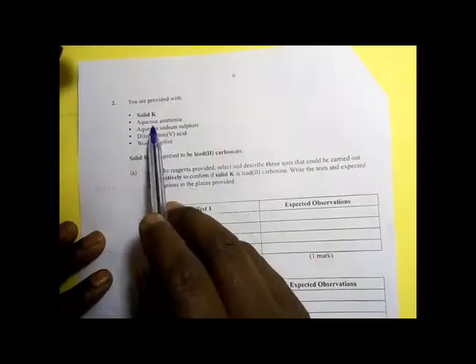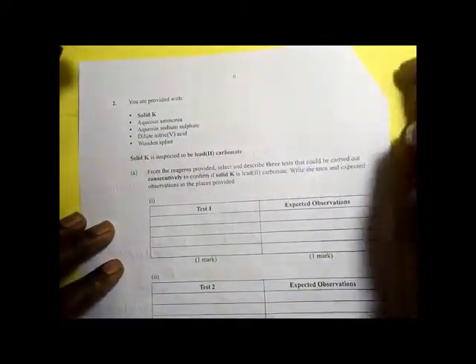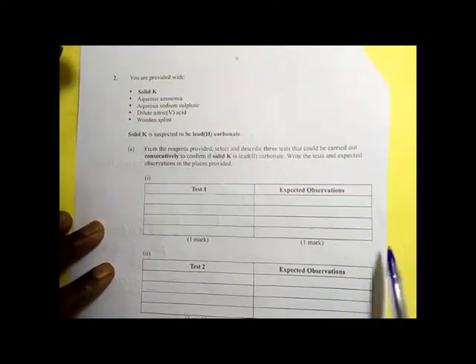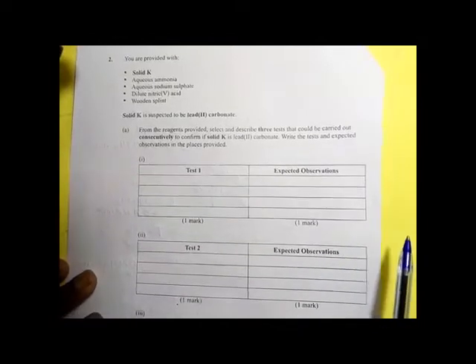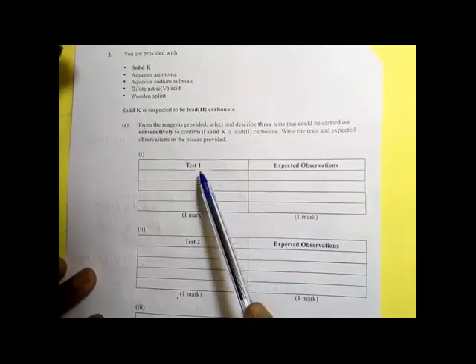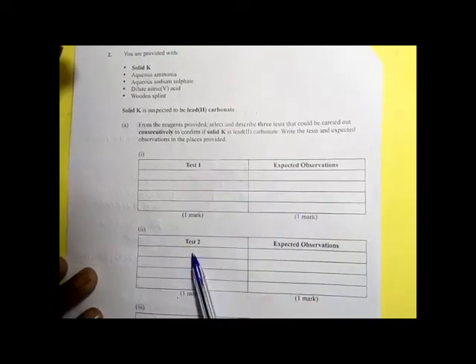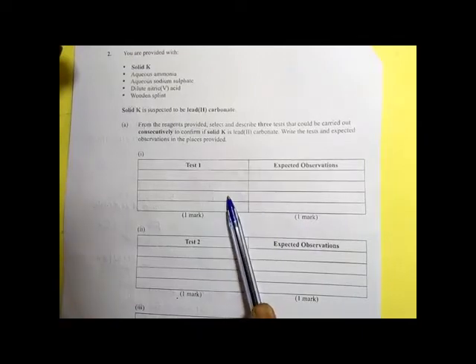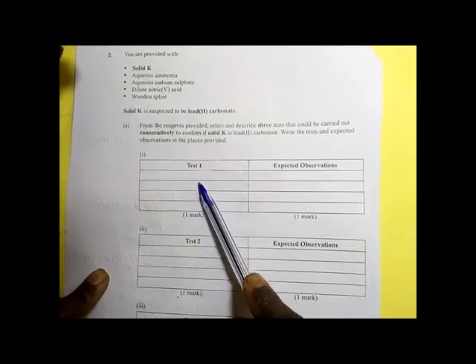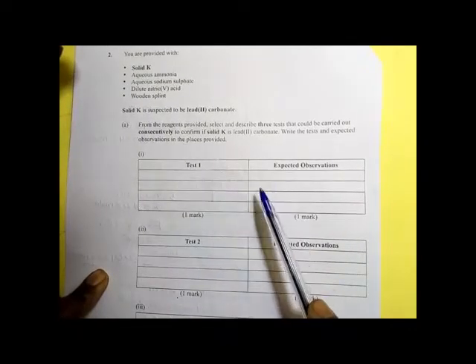The qualitative part of it, 2017, the qualitative analysis. This is the practical that gave most of the students a very big challenge, because here, unlike other years, they were supposed to write the test for themselves and then give the observation. So many students did not get this right, because they were supposed to write the test. If somebody does not know the test, then the observation cannot be made.